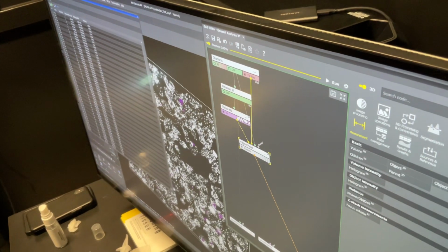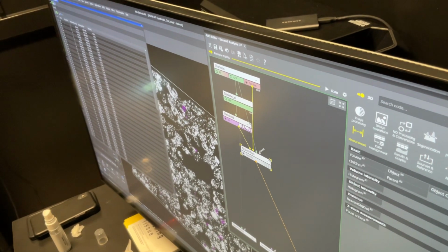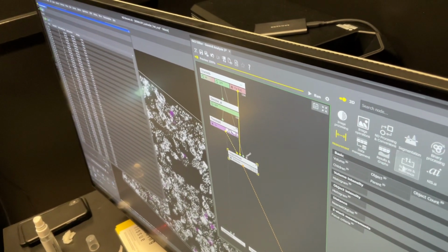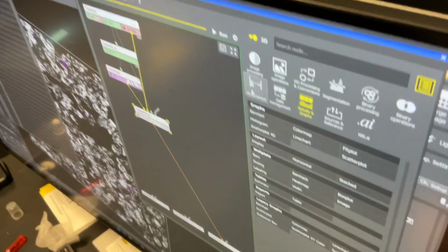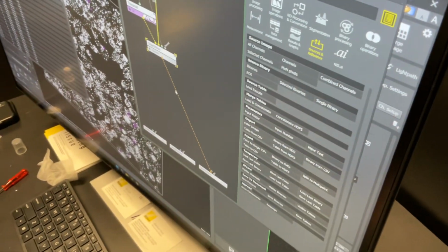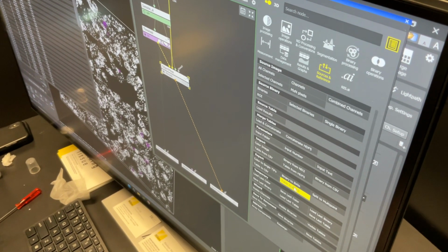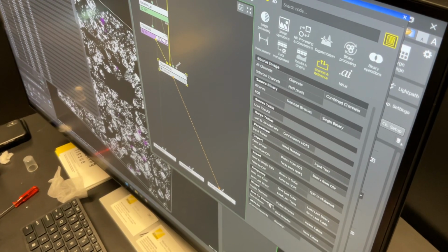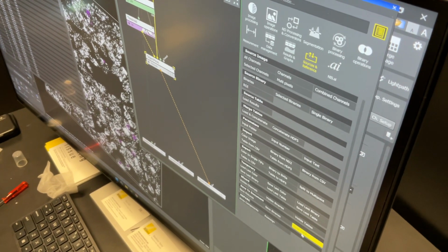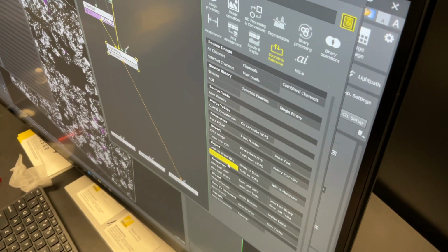Gotcha. It's so high. Yeah. Whenever I do analysis, I'm always like, there's like 5 infected, then it's like 50. Oh my god. But you can also, like we saw, the graphing that we can do. There's also, let's say you don't want to go through the manual step of exporting to Excel, there is, where is it? My export table to CSV.